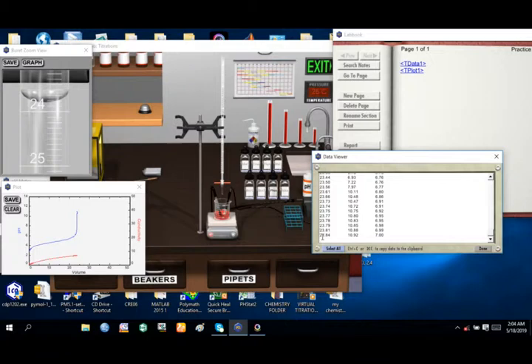So the initial volume here is 23.84, and this is the volume. This one is the pH value and not the volume. This is the pH value. So at this point, this is where the graph gives us the information of how the titrant was completely consumed by the analyte in a weak acid-base titration.